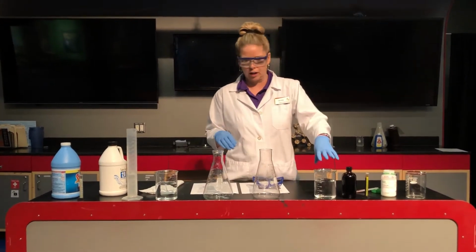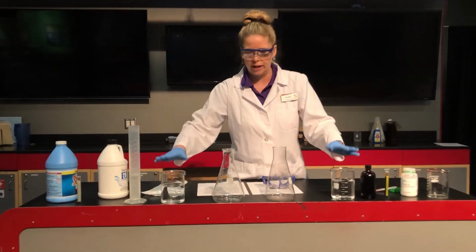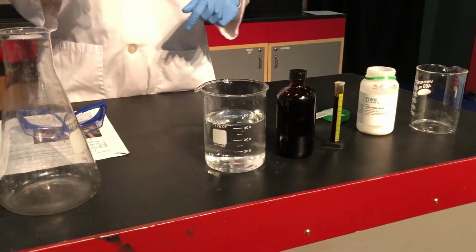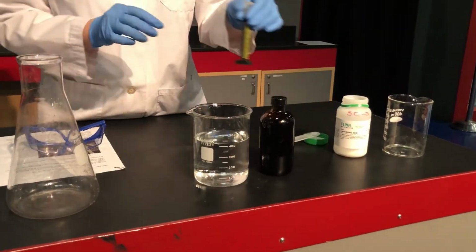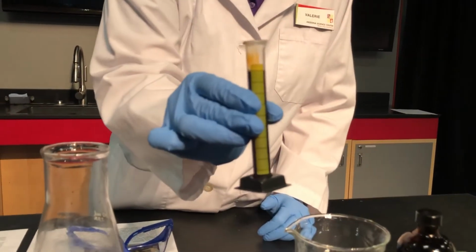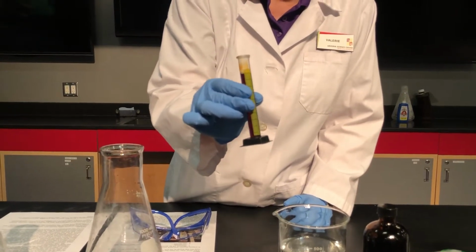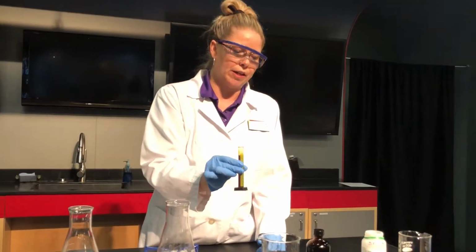So starting off on either side of my table, I just have some regular water right here. Regular H2O came straight out of the tap. The first thing that we're going to add to the water is iodine, and that's what this reaction is named after, the iodine clock. Iodine, if you take a look, is very dark brown, and it is often used in medicine on cuts. You might have seen it before if someone put a kind of a disinfectant on you. It's a very dark brown color.